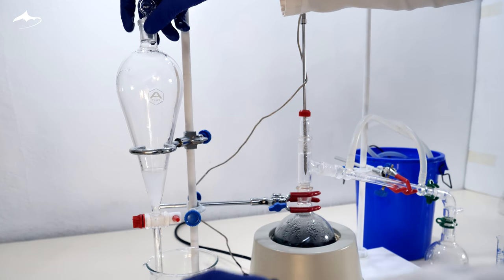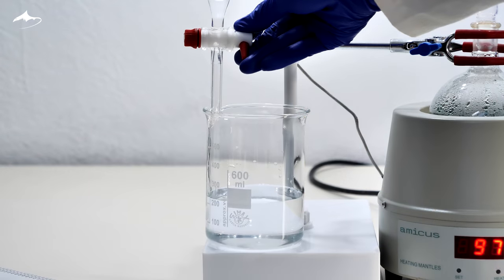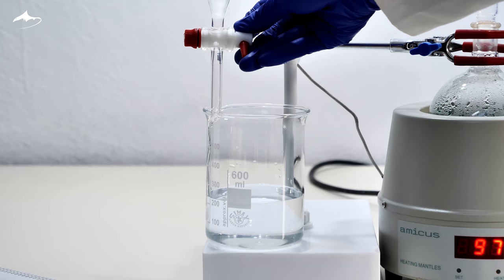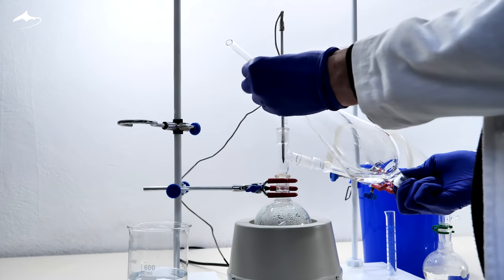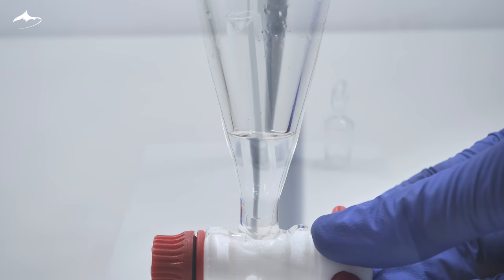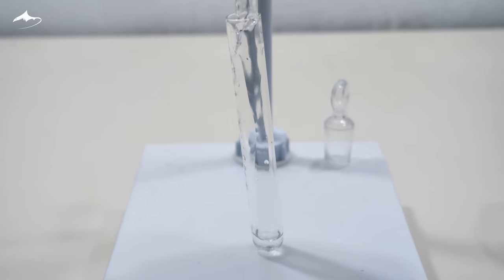Then, and same as before, it is allowed to separate and the aqueous phase is decanted and added to the previous fraction. This is repeated two more times. Once done, the organic phase is collected in a test tube to get an idea of how much yield was lost.